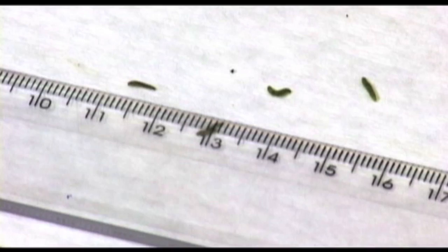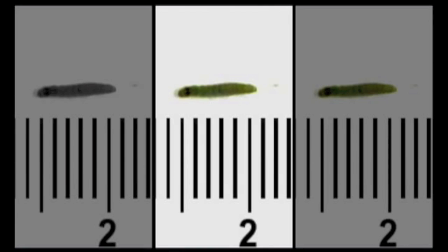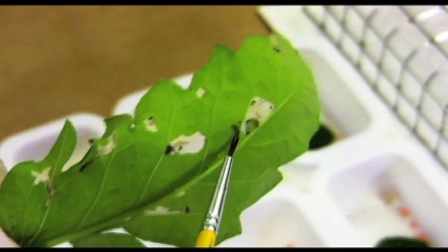Larvae must be carefully selected to make sure that they are the proper size, as previously shown, and that they react normally and actively to probing. Size must be uniform because sensitivity to the insecticide changes with size, which correlates with instar. A fine hair paintbrush could be used to transfer the larvae from the infested leaves to the cell trays, taking care not to hurt the larvae.